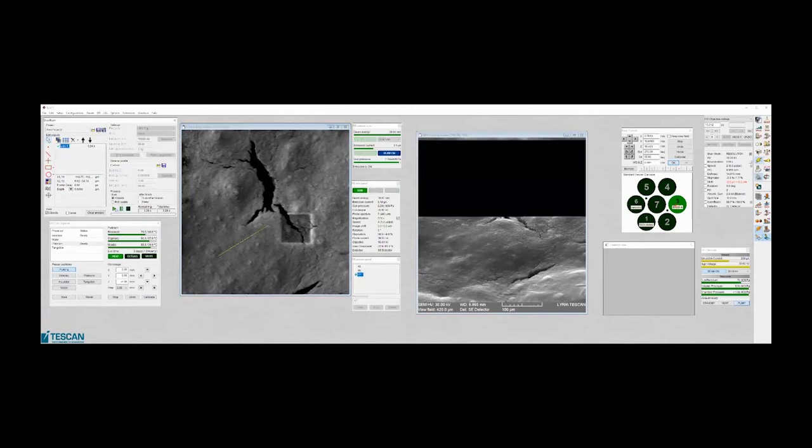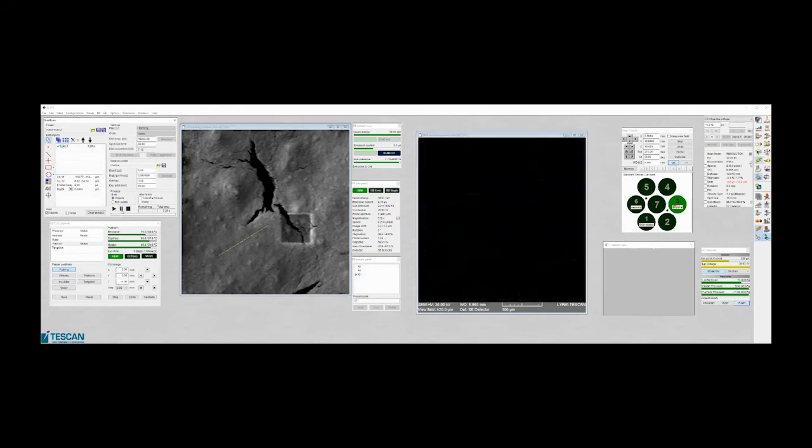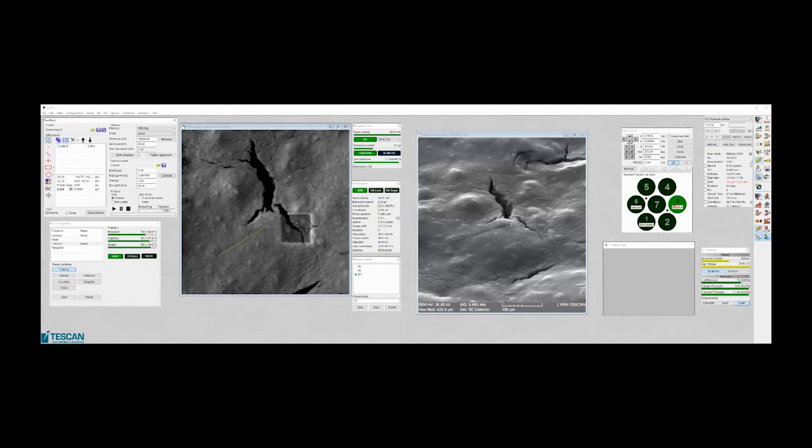So when we run it, you can see directly that we have a line here. We can create different structures. I put here a filled rectangle. Okay, it's too big. It will take 30 minutes, so I don't want it.